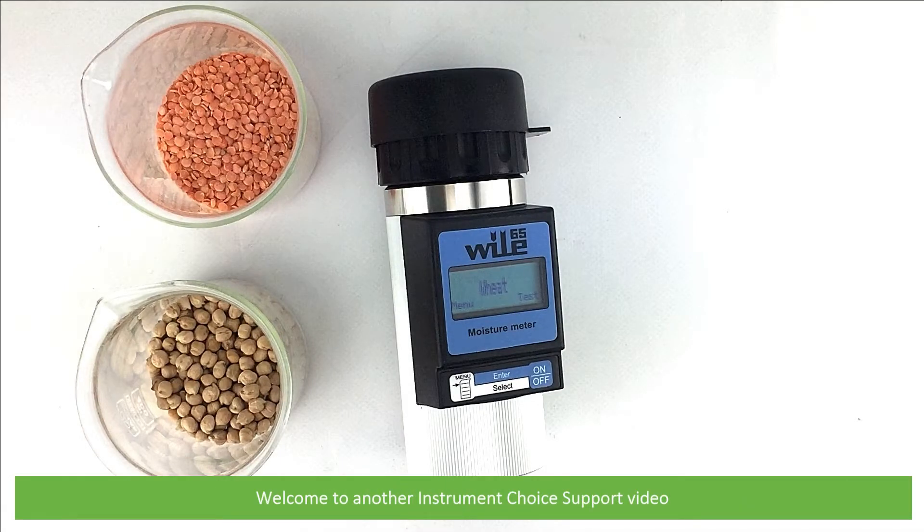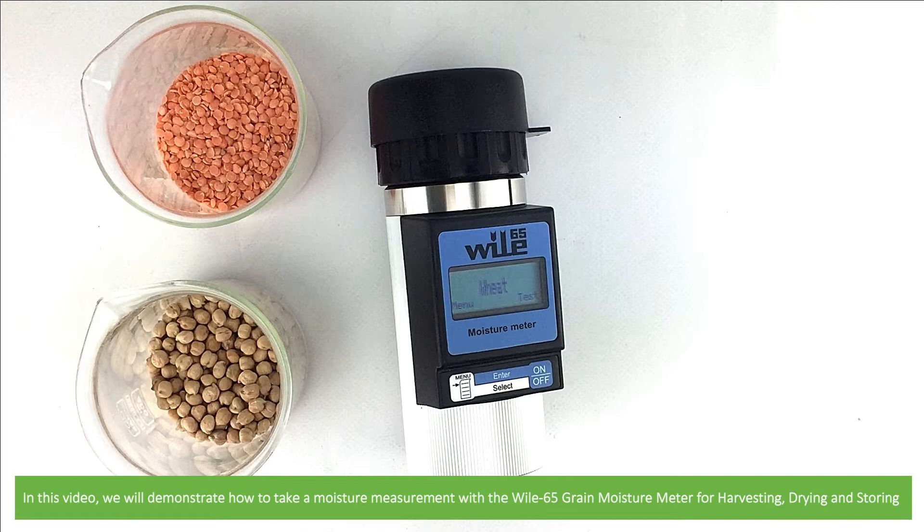Hi and welcome to another Instrument Choice support video. In this video we'll demonstrate how to take a moisture measurement with the Wile-65 grain moisture meter for harvesting, drying and storing.